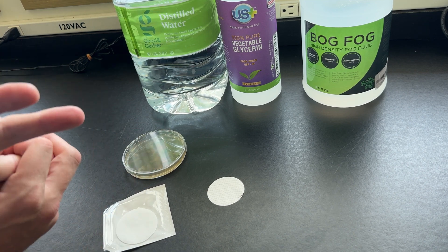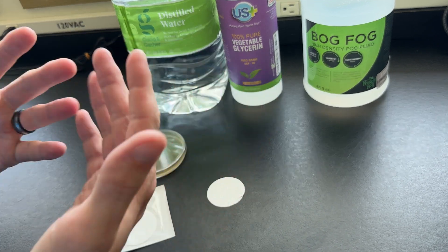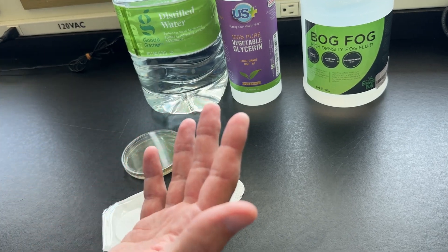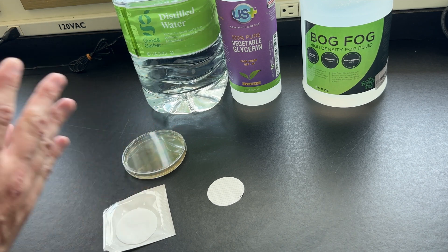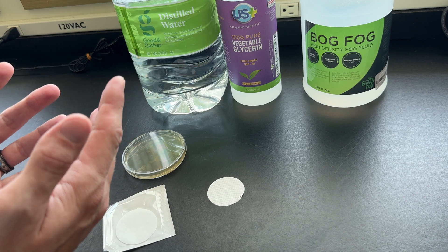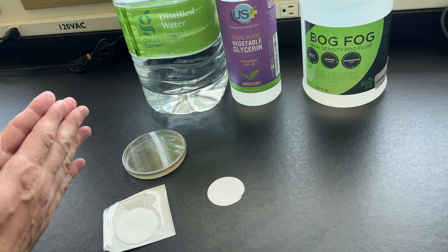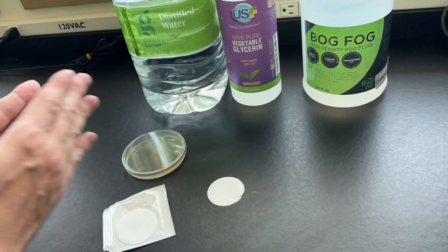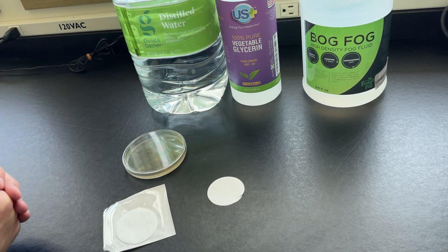There are going to be a lot of things that can affect this — heat, relative humidity, how many times you open and close and shake up your fog juice — all of that will introduce more and more bacteria. So this is not going to be conclusive in a way that would be helpful for determining exactly how to store your fog juice, but it will at least give us the idea of store-bought versus DIY over time: will one or the other grow more bacteria?